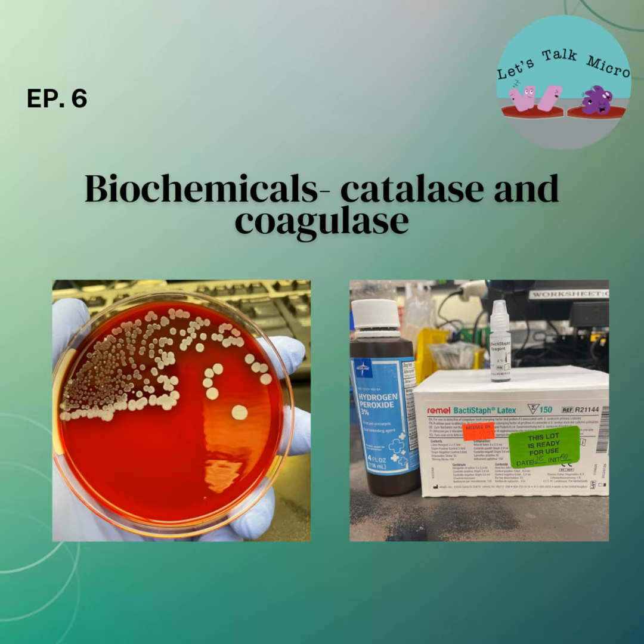I've also been shown that you can do it for 2 hours, make it heavy, and you can see movement. You want to see forward movement across your field of view, and that's considered motile. Once you see that, you can report your culture as Bacillus species, not anthracis. If your Bacillus was beta hemolytic, then there is no need to do the motility because Bacillus anthracis is non-hemolytic.